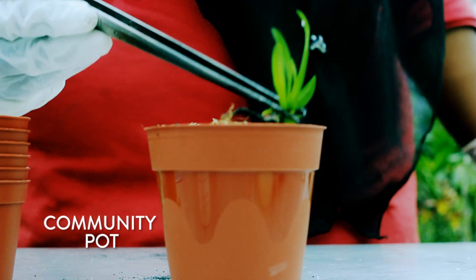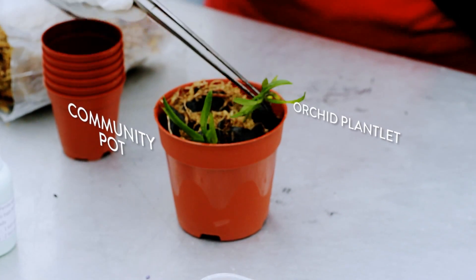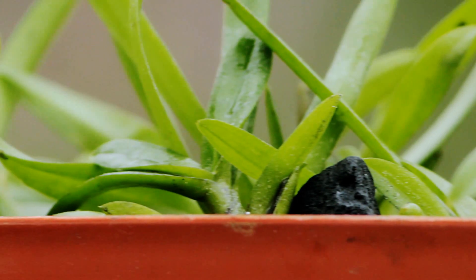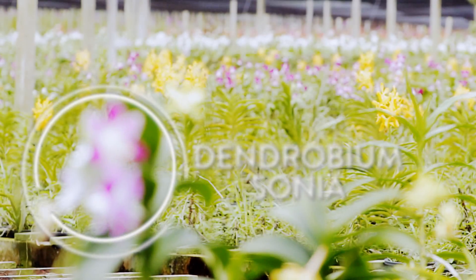The plantlets are then separated into containers before being placed in their own community pot. Through these steps, the plantlets eventually become any number of fully grown plants, which are genetically identical to one another and carry the same characteristics.